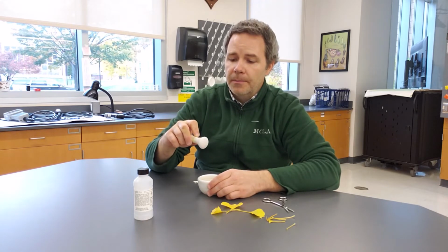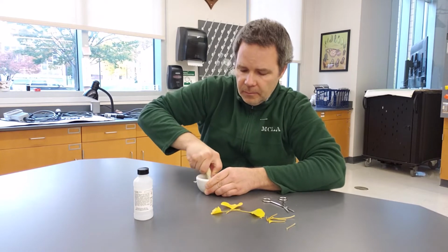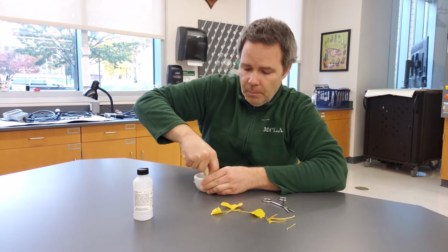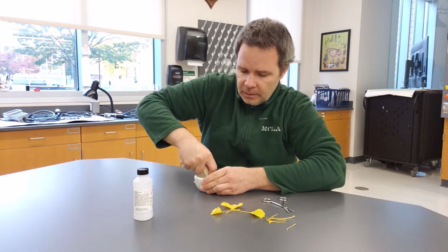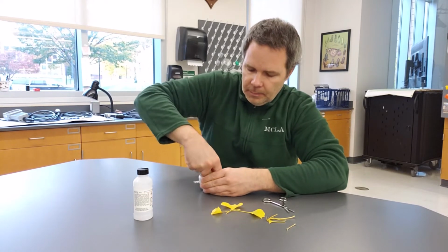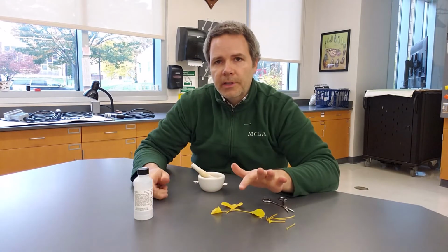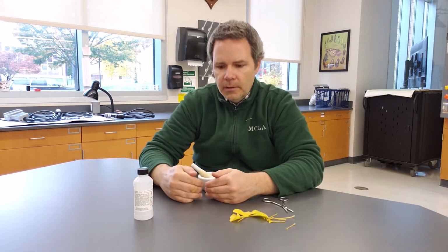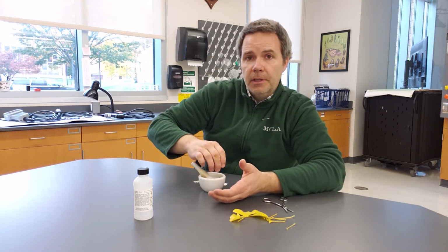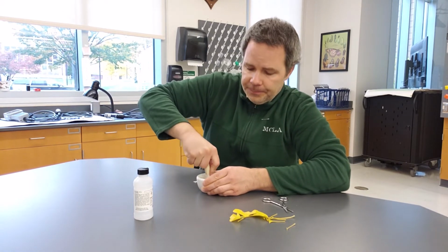Then I'll use my pestle, and I'm just going to grind away at those leaf bits. I need to put in some real effort, what my dad would have called elbow grease, to mash these up. And I'm going to take a few minutes to do this. So what I'm trying to do is break down all the cell walls and the cell membranes so then those pigments can come out into the ethanol, and then I'll be able to pull up the pigments with the ethanol and transfer them that way.